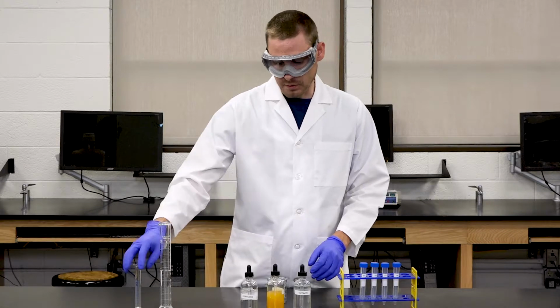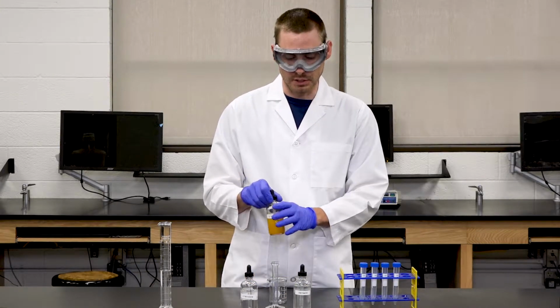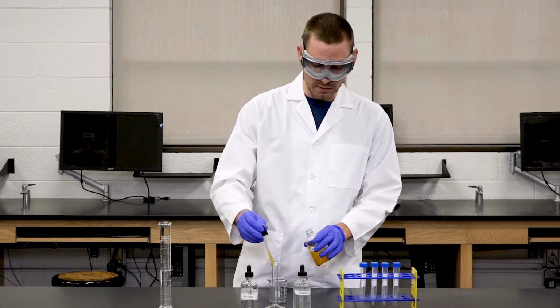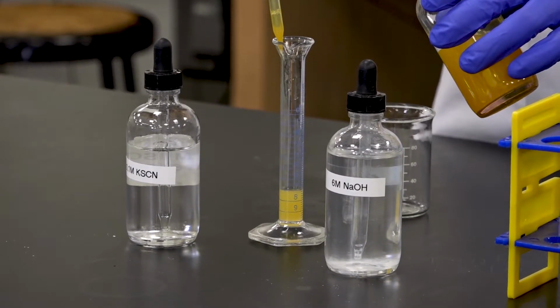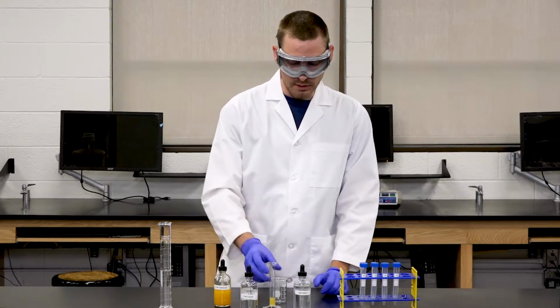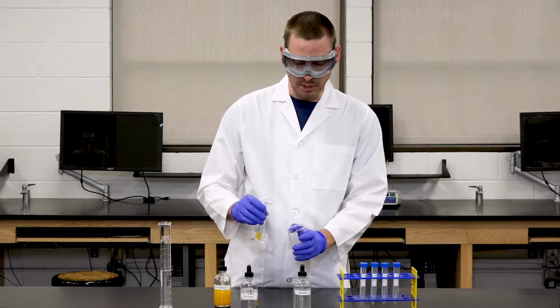So to begin, we're going to add 3 milliliters of the 0.1 molar solution. So we'll add that 3 milliliters of the iron nitrate solution to the beaker.